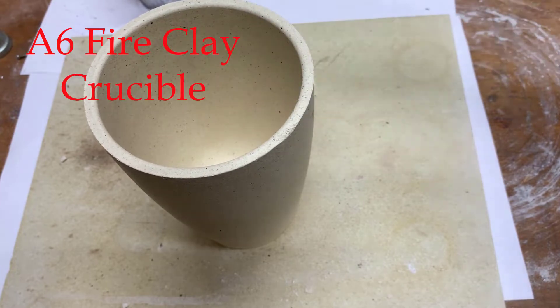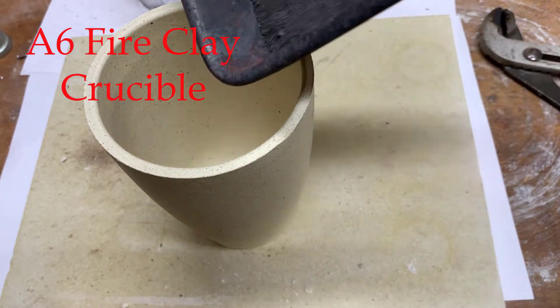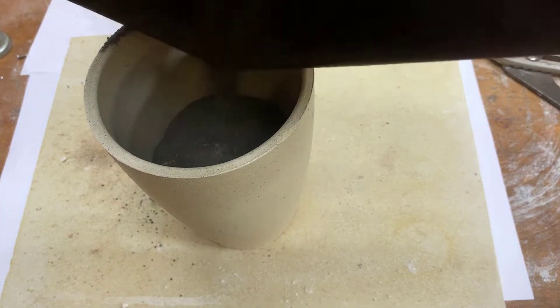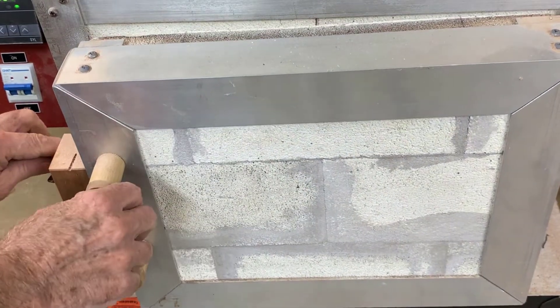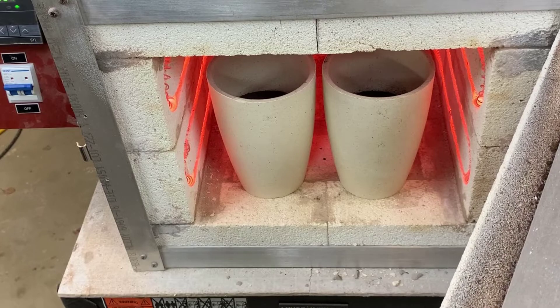There's a brand new A6 Crucible, the charge is going in. And there are the two smelts in the kiln.